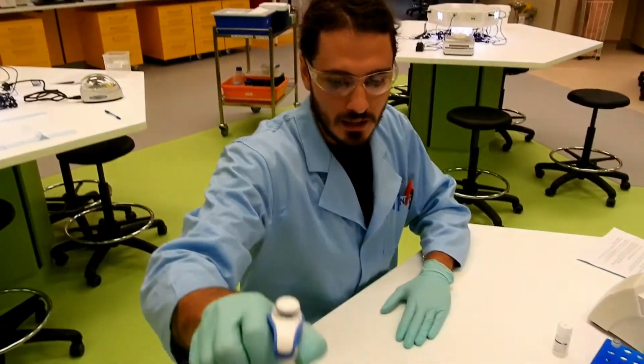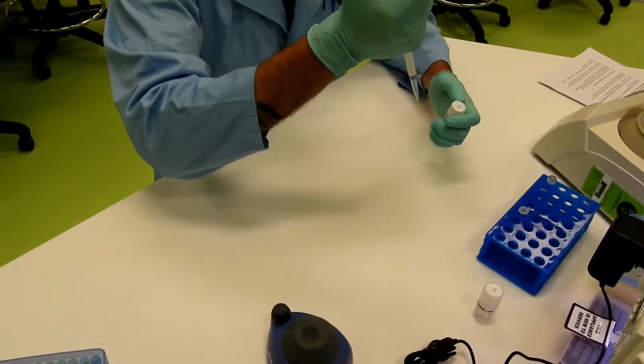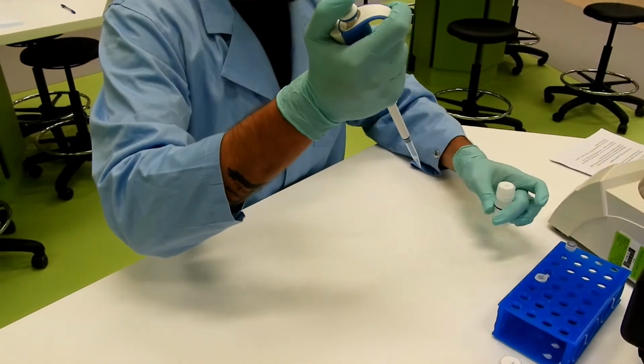Next, we need to remove non-DNA cellular material from our sample. This includes using reagents to remove organic and inorganic materials such as humic substances, cell debris, and proteins. To do this, we'll pipette 200 microliters of our C2 solution into our sample.